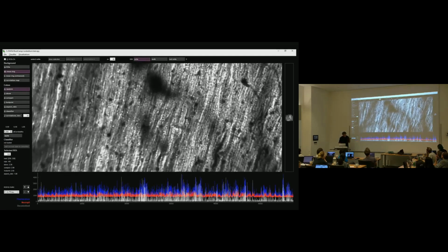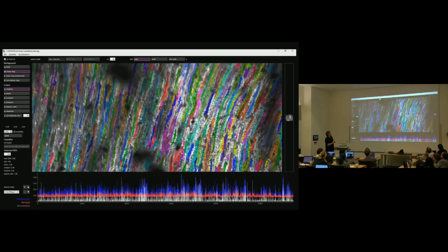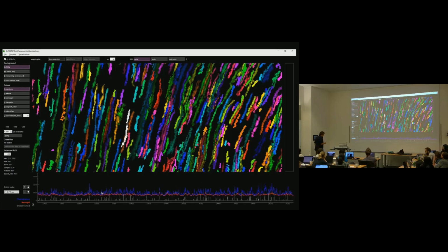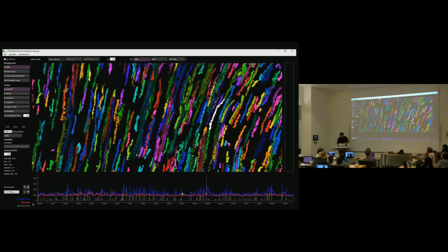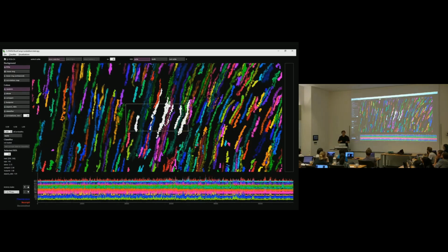Okay, this is just another thing to point out here, since we're looking at this data. Another way to know your registration worked is if your mean image is very crisp like this. If you can see pixel level details, like the synapses on these dendrites, that's a good indication that registration worked. Otherwise, things would be more blurry. You wouldn't get access to those fine scale things. And if registration failed, you'll see it in the ROIs too. You'll see things will be split. You'll see cells offset. Because that creates a lot of correlations between pixels.